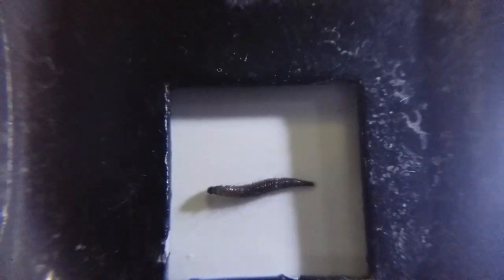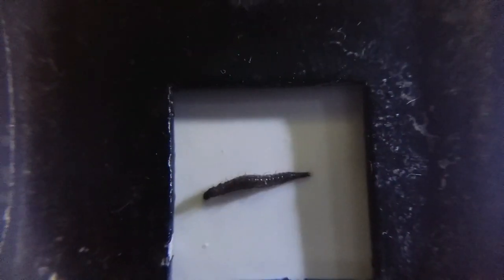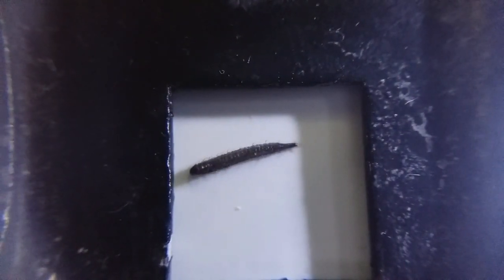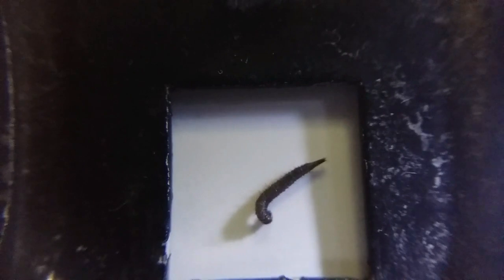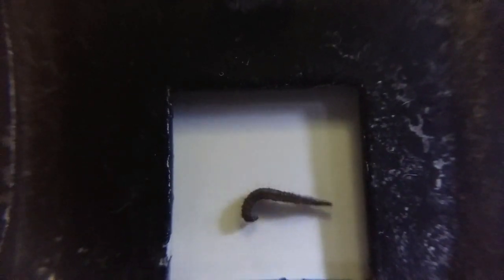Light system is online. Are you ready guys? Here it is. Weird world — look at that. Damn. Look how dirty it is. Look at that — this is a weird-ass wall. This is sick.